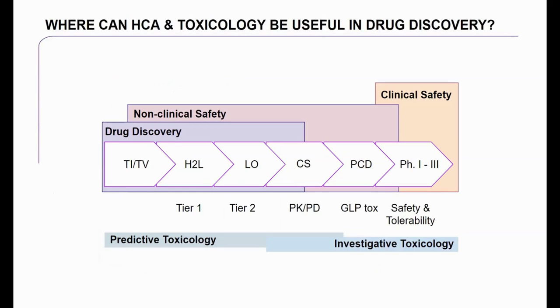Where can the high content analysis methods be useful? Well, definitely at the very early stages of the discovery process, as we've shown, they can be very useful. They can also be very useful for predictive toxicology.